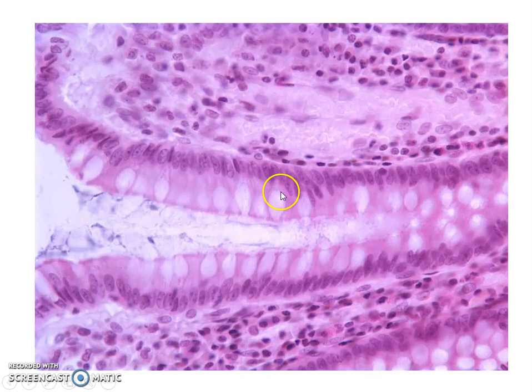So here you see columnar epithelium. You can see this has lots of goblet cells. So this tells us that, and the fact that here is a lumen, this tells us that we're dealing with epithelial tissue, specifically columnar epithelial tissue. And the fact that the nuclei of all these cells are found so parallel to one another, or found all at the same level, this tells us that this is simple columnar epithelium.